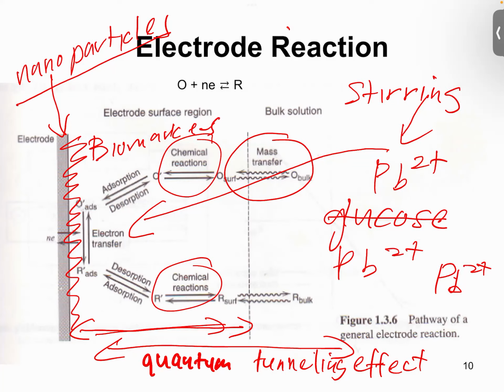So we have to balance how much, and that's why we have to combine with nanoparticles, metal nanoparticles, conducting polymer to enhance the electron transfer, so that whenever we put the biomarkers, it will not lower down the current produced, because in electrochemistry we rely on current.